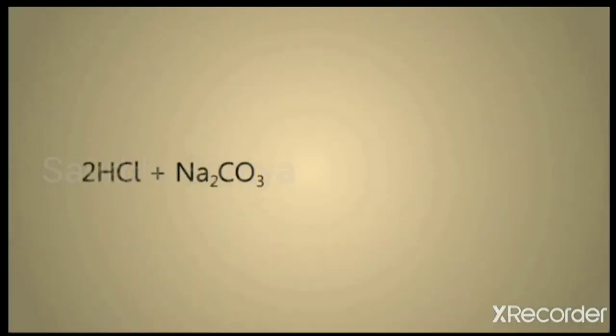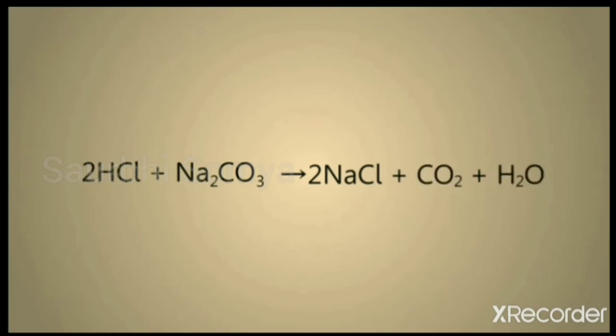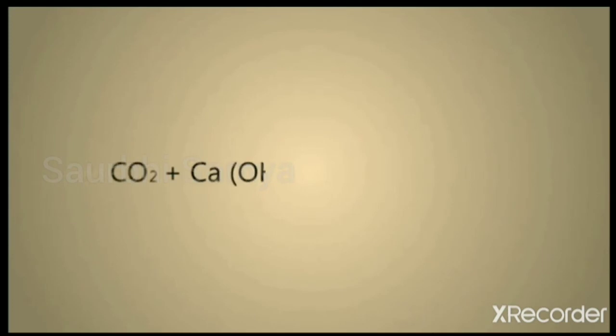2HCl + Na2CO3 gives you 2NaCl + CO2 + H2O. Similarly, CO2 + Ca(OH)2 gives you CaCO3 + H2O.